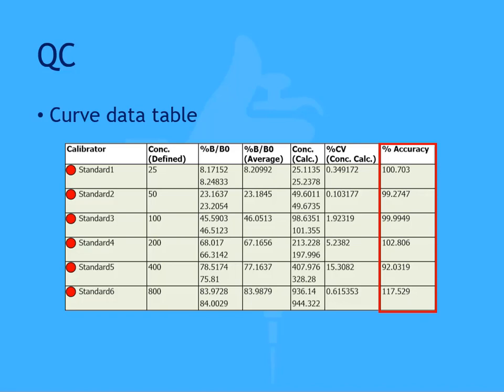You can easily set acceptable thresholds using the standard curve fit transform, and standards that are within the limits are highlighted in green, and any standards that are outside the limits are highlighted in red. The default limits are set to 20, but you could change the limits to fit your needs.